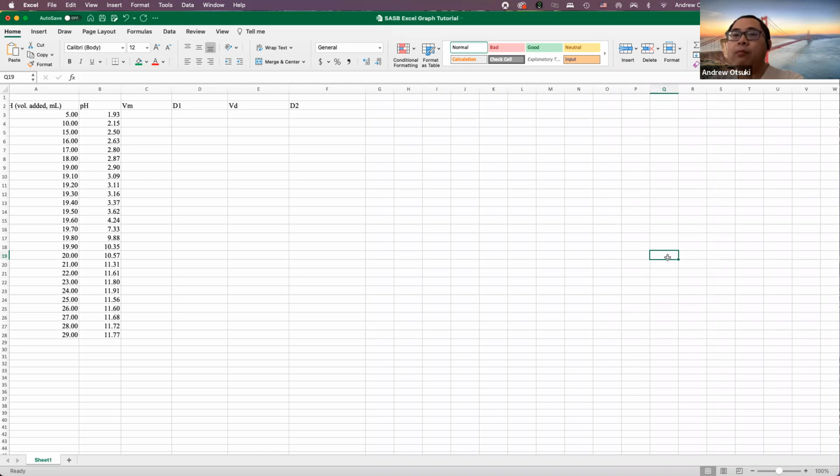So for this lab, we're going to be lenient. I'm going to be flexible. I gave everyone data, complete as much of the post lab as you can. If there's any issues, like if you need retrials, my recommendation is just duplicate all the data, and that'll make your average. And the concentration you determine based on this data, you should just put that as the concentration of your sodium hydroxide solution. And from that data, determine the concentration of HCl, and you're going to put that as your data for the HCl solution you made as well. So if there's any confusion about that, I'll remind you in lab next week.